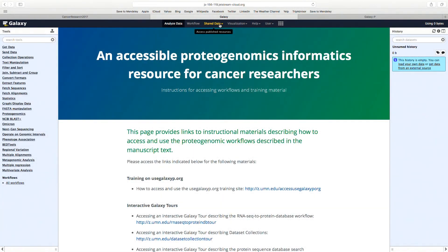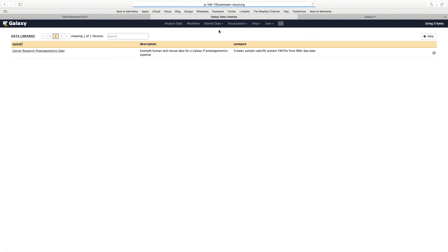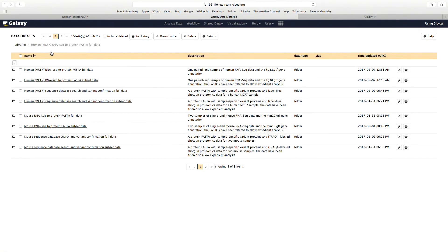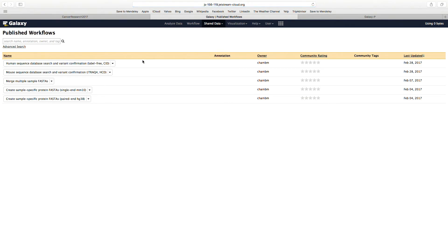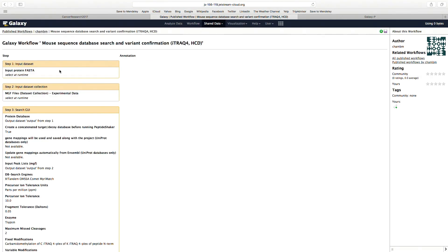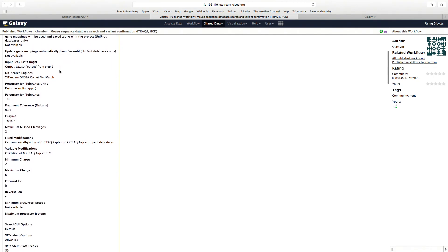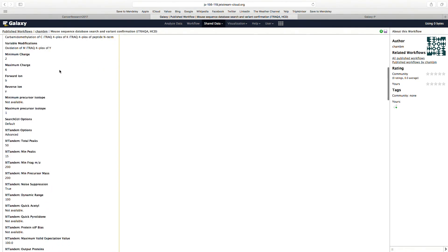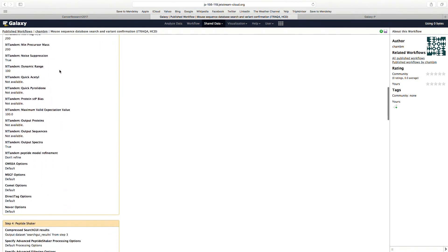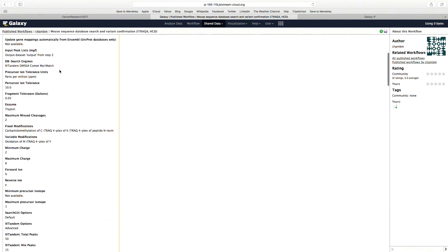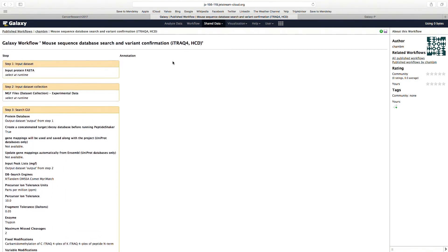Within this Jetstream instance, we have made available input data for our workflows. We have also made the workflows available. The saved workflows contain all software and validated operating parameters required for their use. Users can upload their own input data and make use of these workflows for proteogenomic analysis.